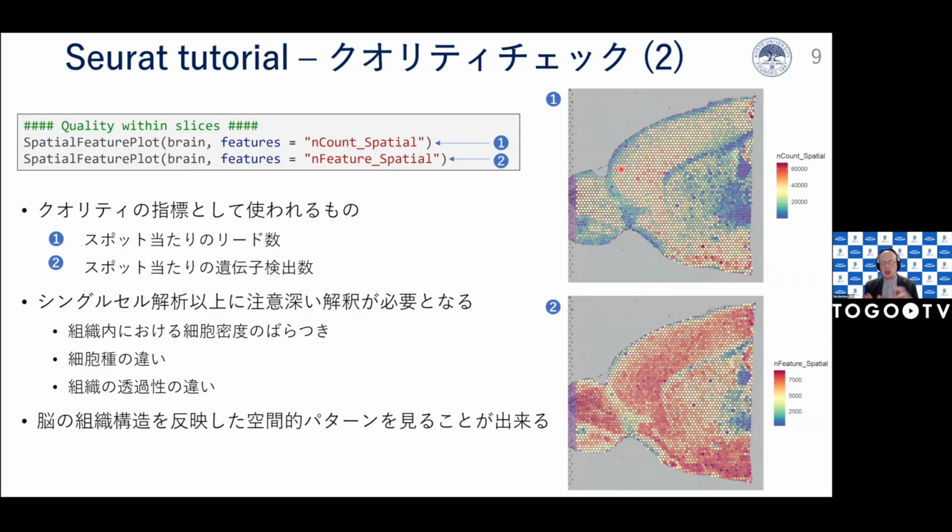In other words, you can see it in the raw data. And also, if you read your data into R, there is a function to extract the location of every spot. But what's the name of the function? I think it's something like get coordinates. So you can also get it through Seurat, but I don't remember the name of the function.